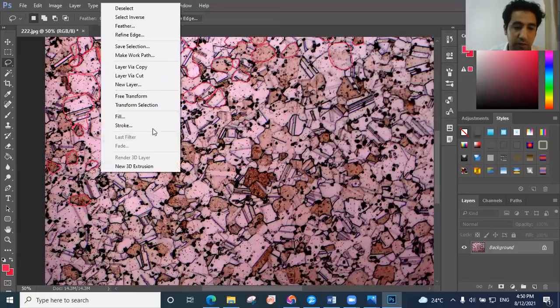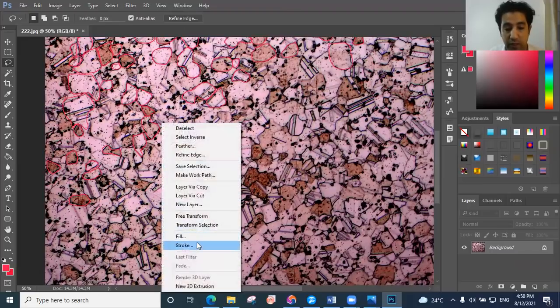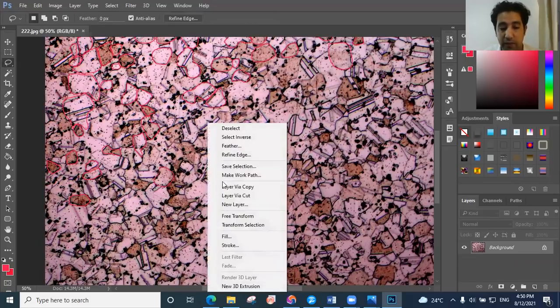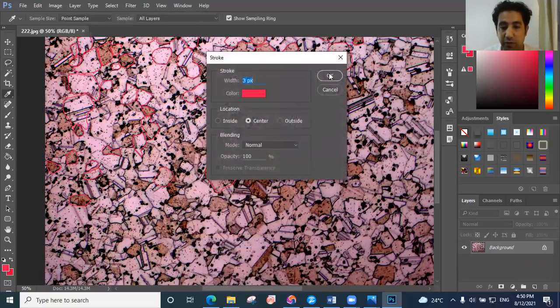This step is necessary to give you clear and exact information when you want to write a paper about any data, and you need correct data for your papers. So you need to use these, and you will face some problems. I'm gonna show you how to solve them. That's why I'm gonna do every step by step in this video.